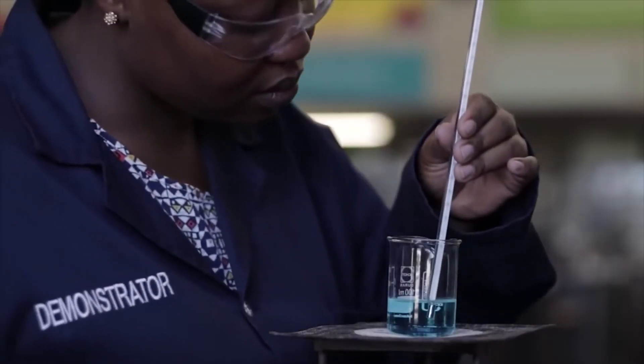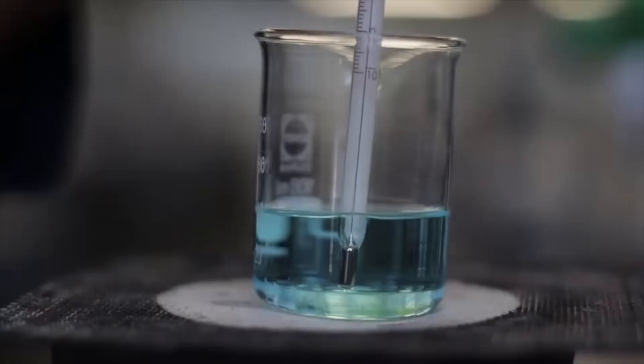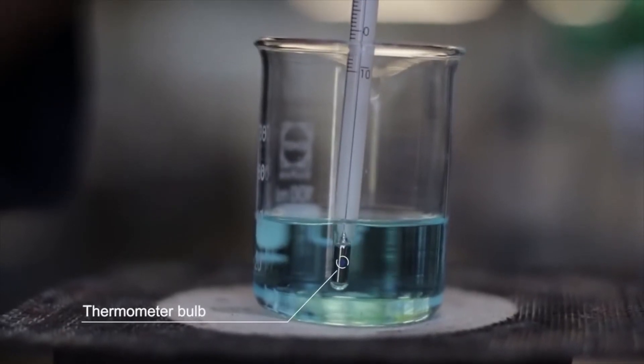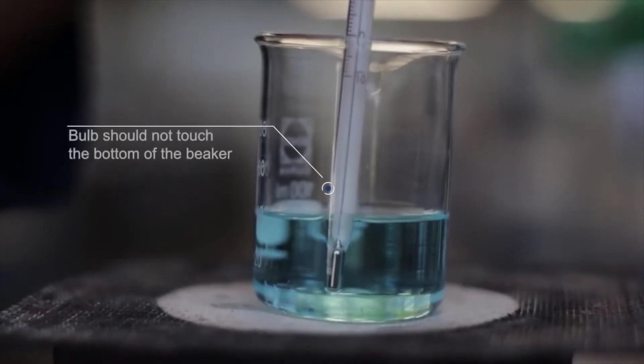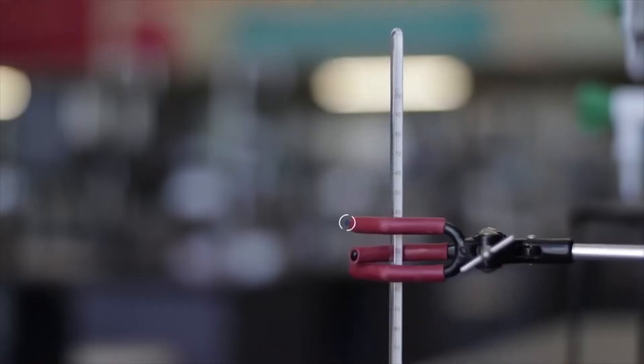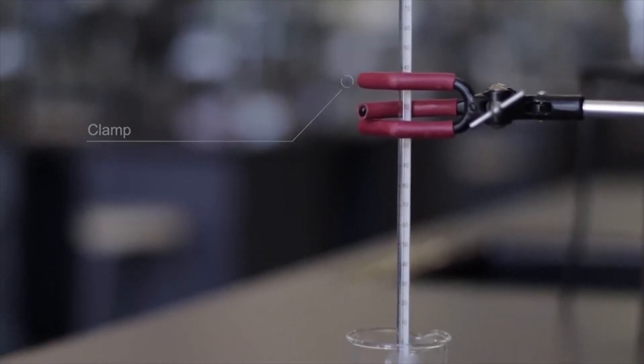A thermometer measures the temperature of a solution. The bulb of the thermometer should be immersed in the solution and the bulb should not touch the bottom of the glassware. If needed, the thermometer can be secured with a clamp.